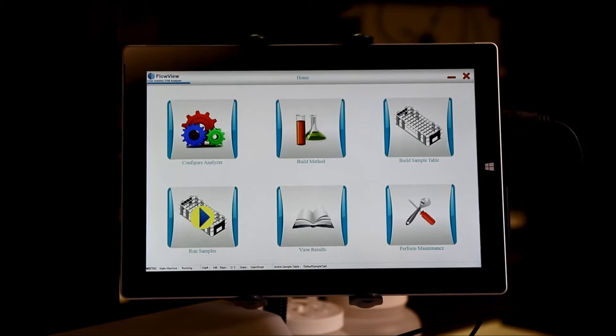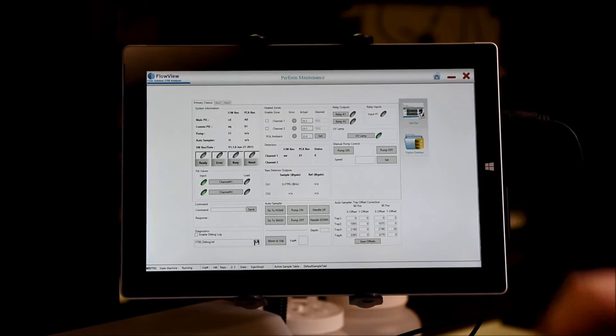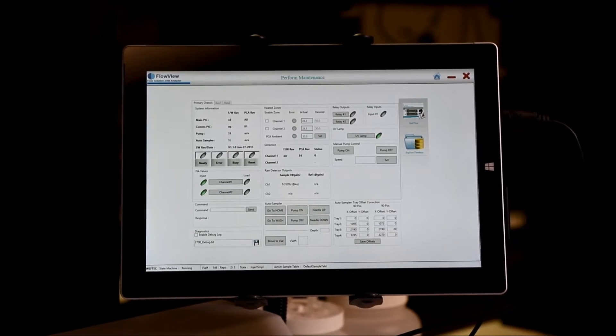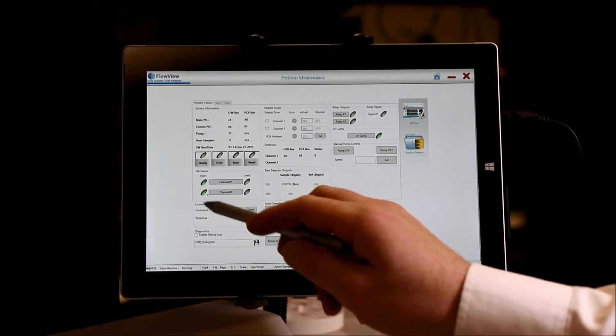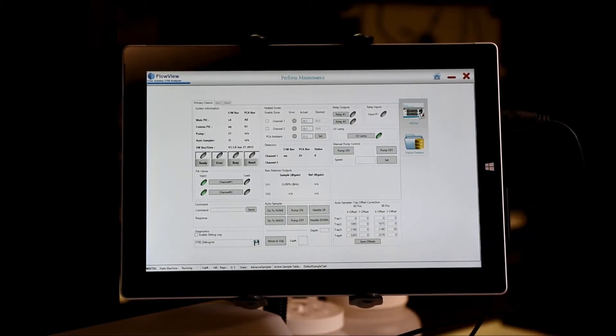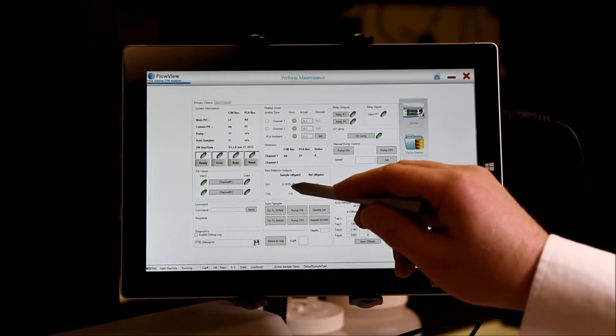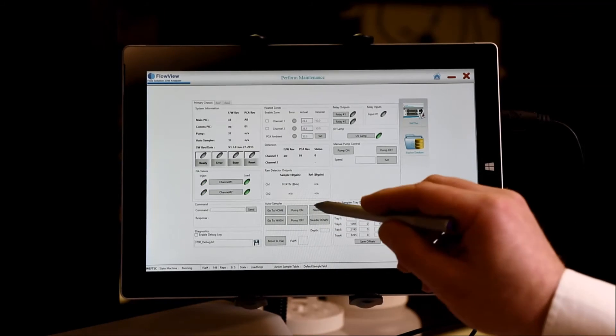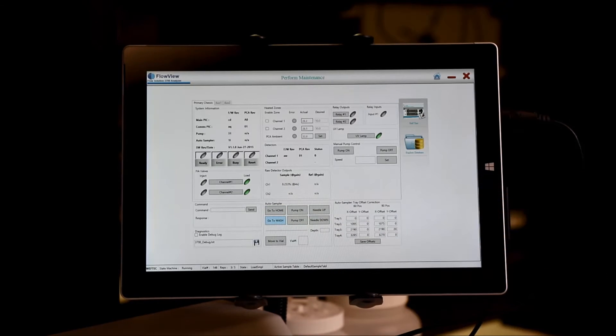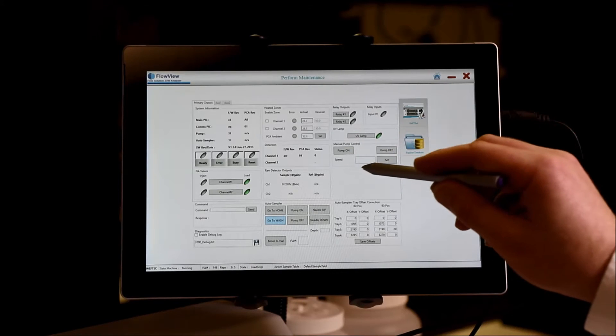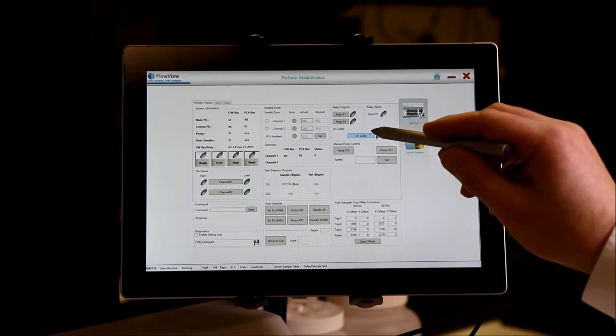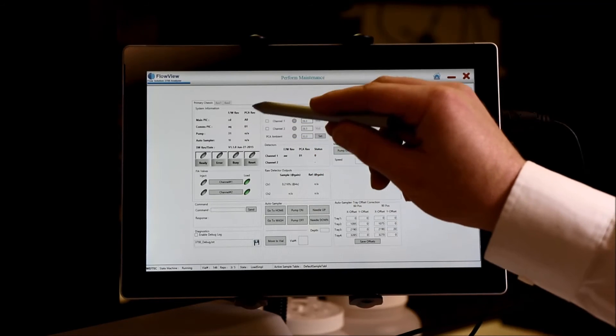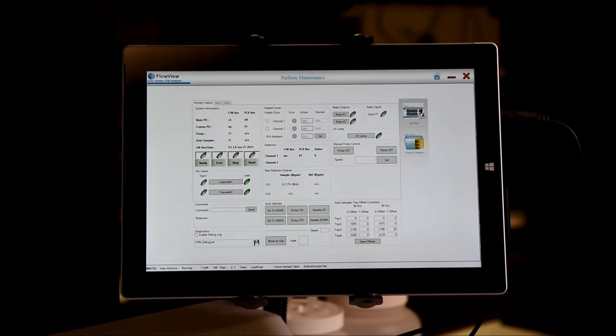The last button on the screen is the Perform Maintenance button. This can be accessed at any time during, before or after a run. It will give you the state of the FIA valves, if equipped, what the temperatures are on your heated zones if they are enabled. It will also provide a raw detector output for your amperometric or photometric detectors. You may manually control the autosampler utilizing commands here, manually take control of the pump, turn on or off the UV lamp, as well as see the firmware codes and any errors that are produced by the software.